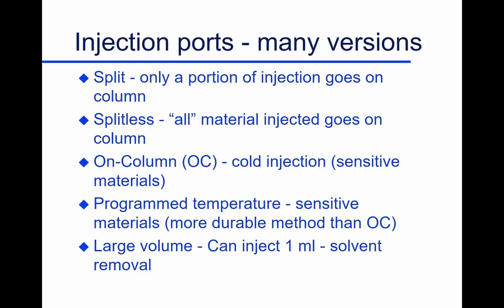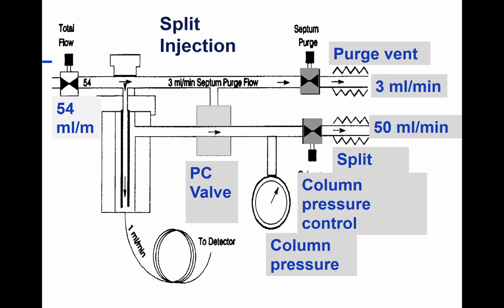So you can have a split, which is most common, a splitless, which tries to give you greater sensitivity, or let's say a methodology where you can avoid the high temperature that you see in the instrument. And there are all kinds of other variations, but by far this is number one. This is number two, and there's a small amount of this done. So these top three encompass 99.99% of the work that's done. And this gives you an example of a split column and puts it into numbers, what I tried to show you. So here's our carrier gas coming in from our helium tank.